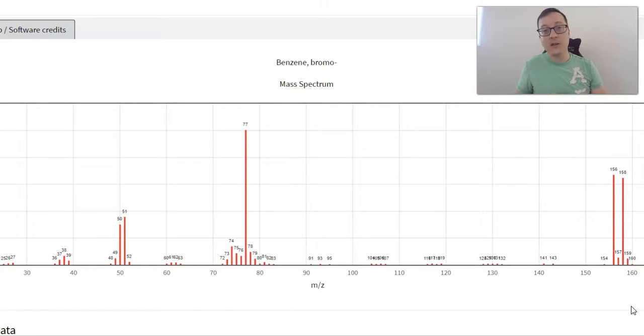By now, you can figure out the number of carbons by looking at the m+1 peak. You can figure out the presence of chlorines or bromines by looking at the presence of a significant m+2 peak. Nitrogens you can tell by looking at whether you have an odd or even molecular mass. And finally, oxygens can be determined just by making sure that your number of hydrogens makes sense after you've subtracted your carbons and any other known elements.